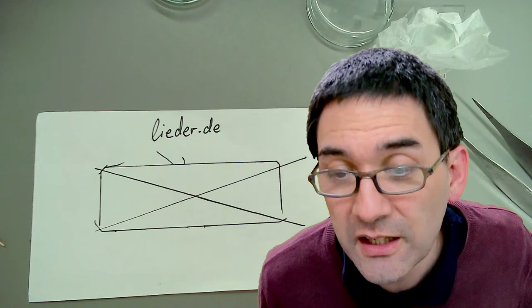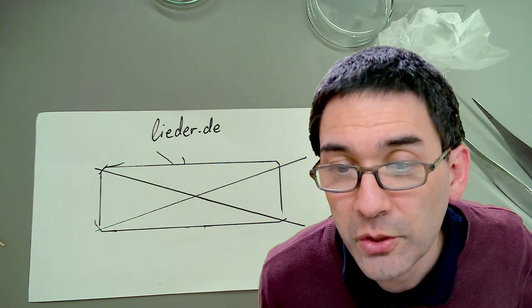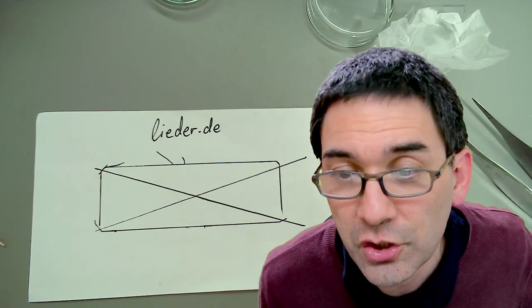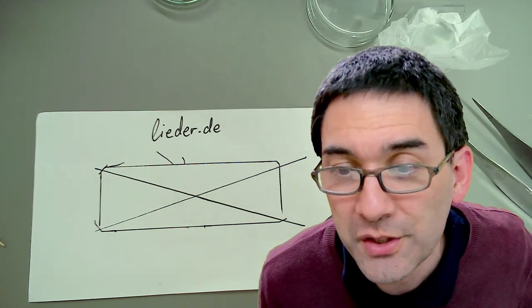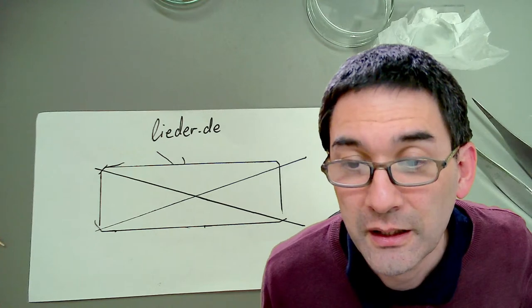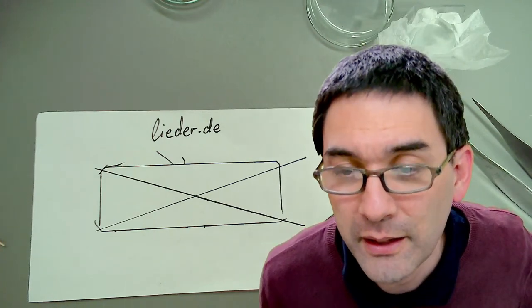The stingers are straight. They have small barbs, which is why they stick in soft tissue. I'm excited for my birthday next Sunday. I will be even happier if microbehunter spawns have higher biodiversity so they can join the live stream. I think I've got to go out and find some microorganisms now.